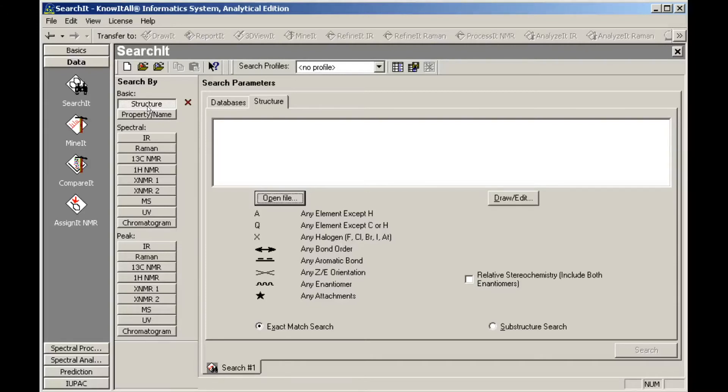If we draw or edit a structure, we can use any of the variable indicators listed on the search tab. We'll use an existing structure file in this example.